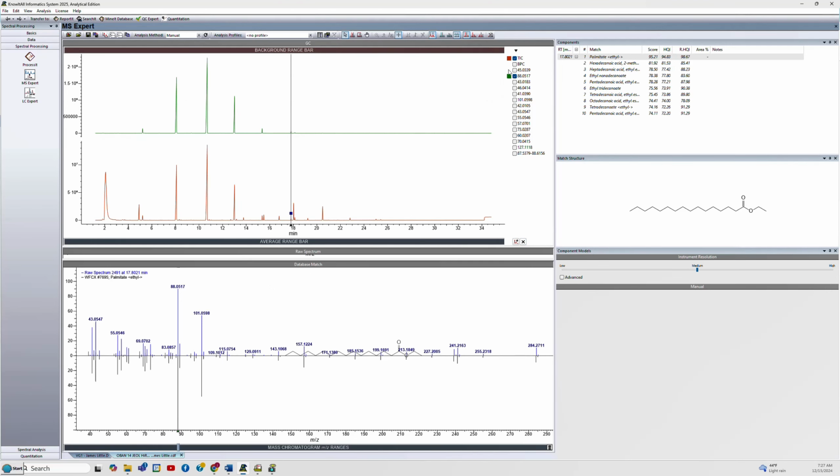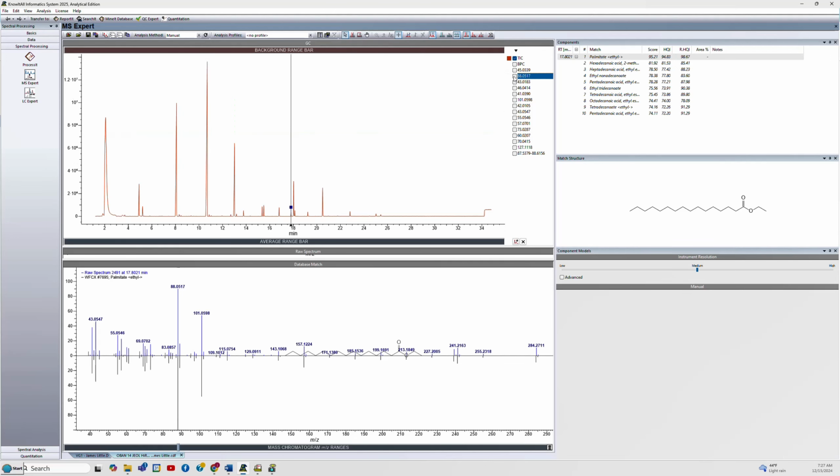So let's again clean up a little bit. I'm going up to the mass chromatograms and making that one disappear. I just wanted to show you one last thing. I'll go back to the cursor. I think I'll get rid of the cursor, close it. And so we'll go up to Edit, View, the top, and let's do peak areas.